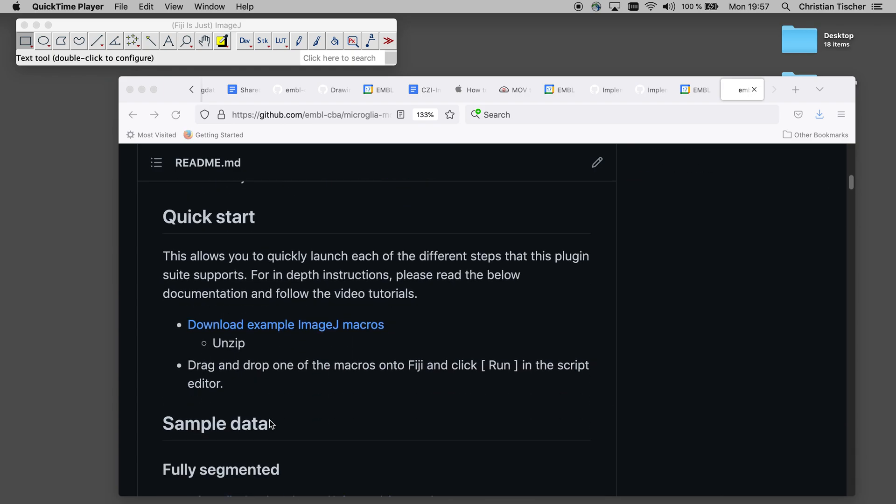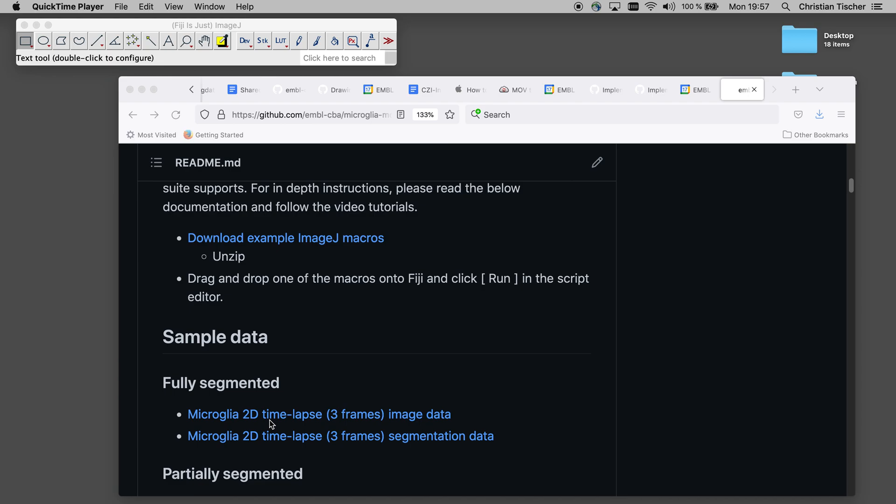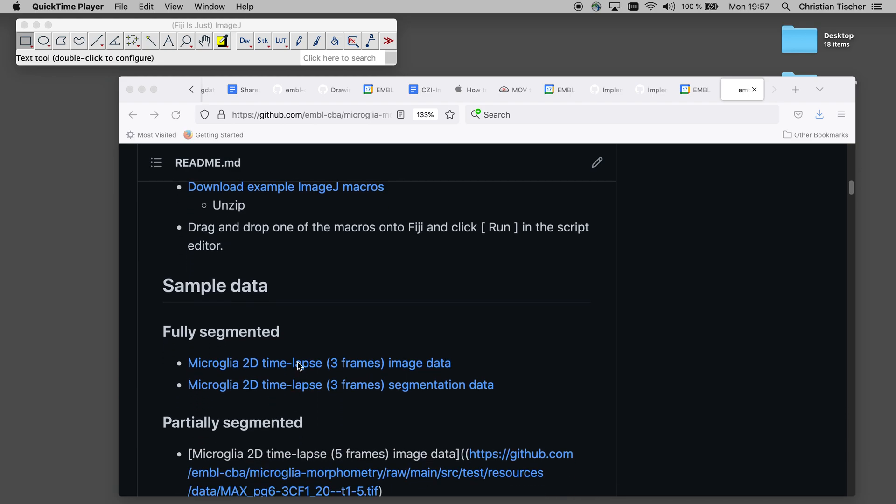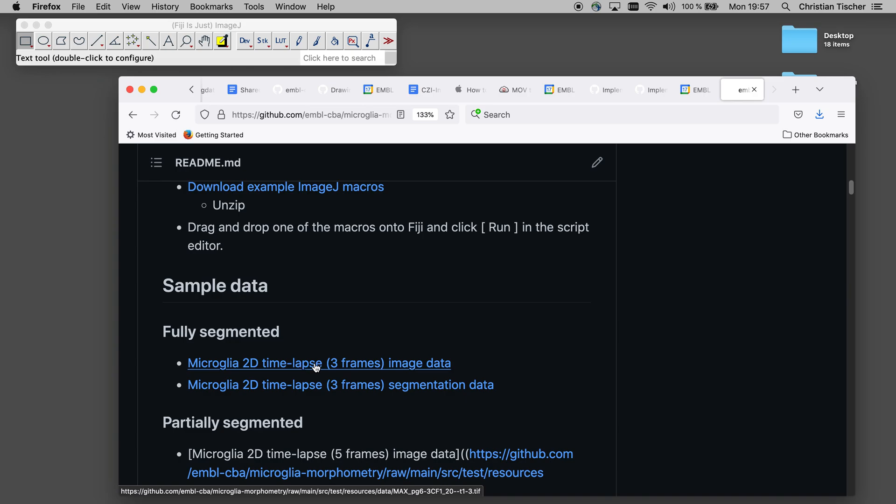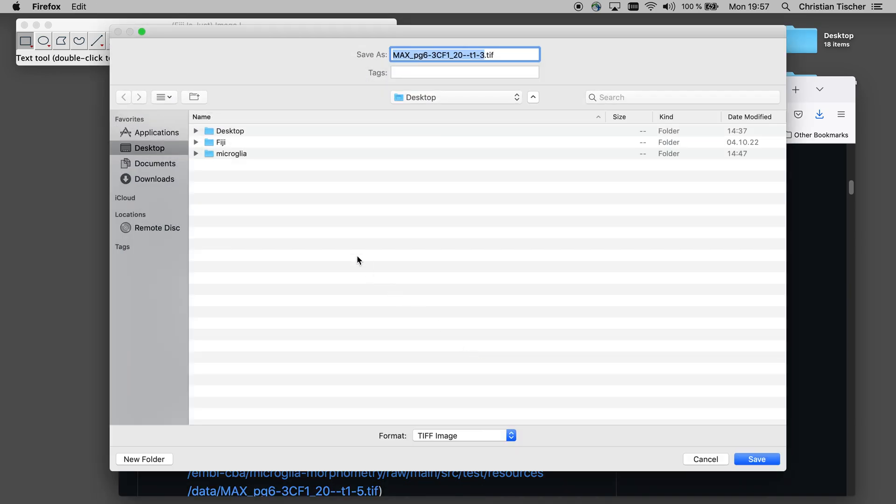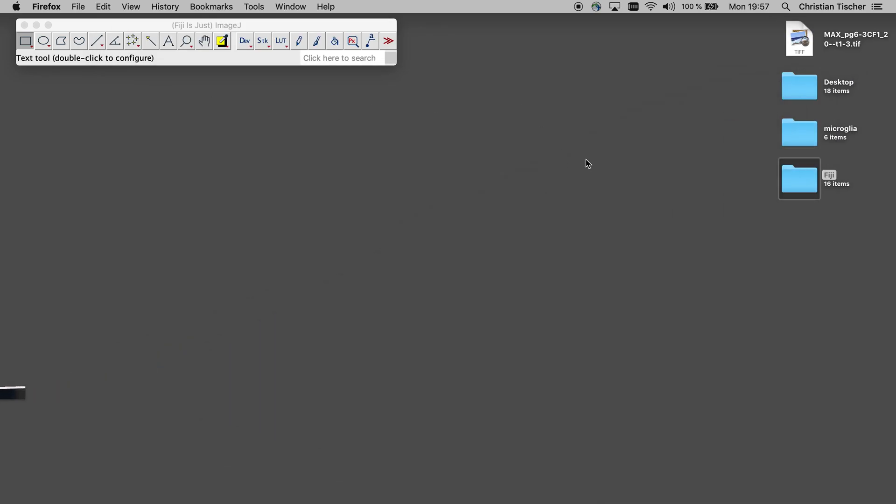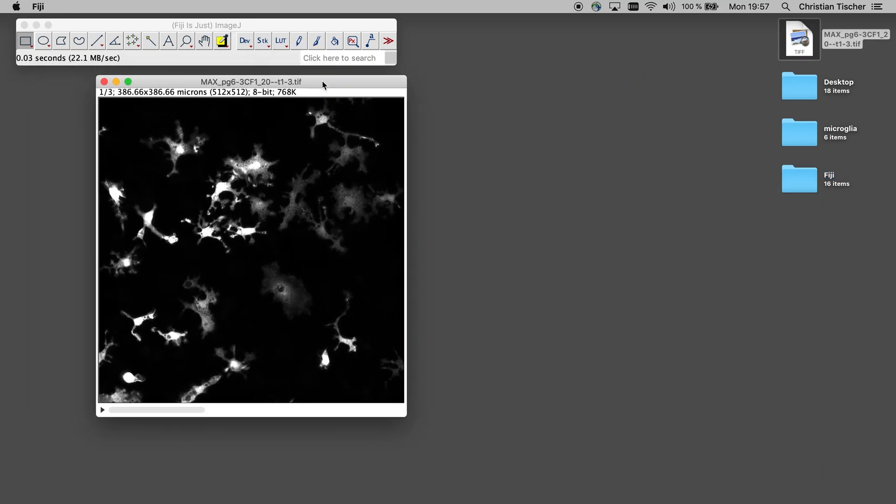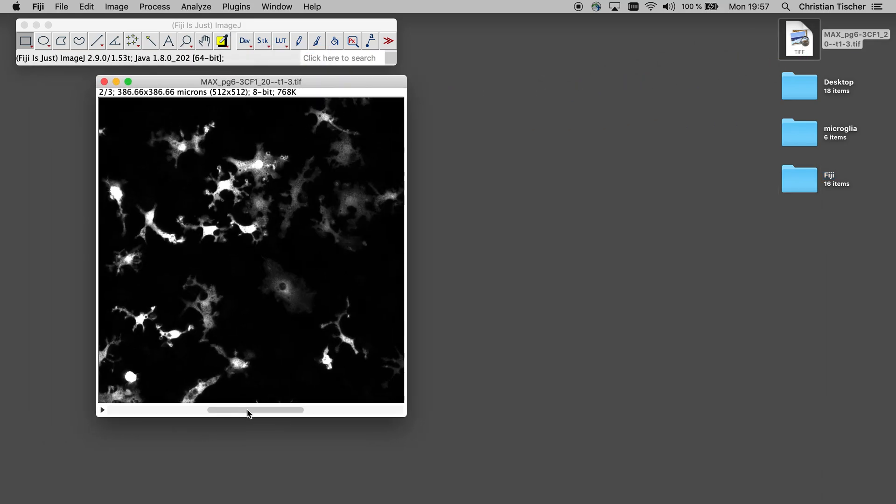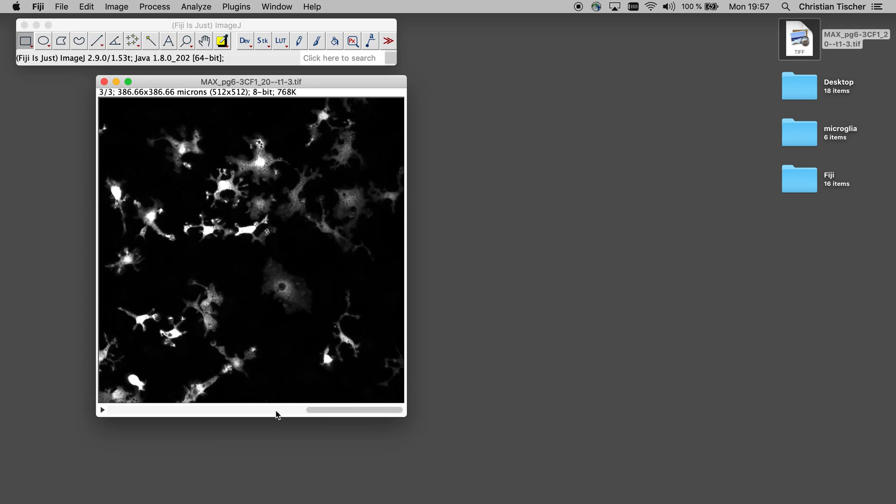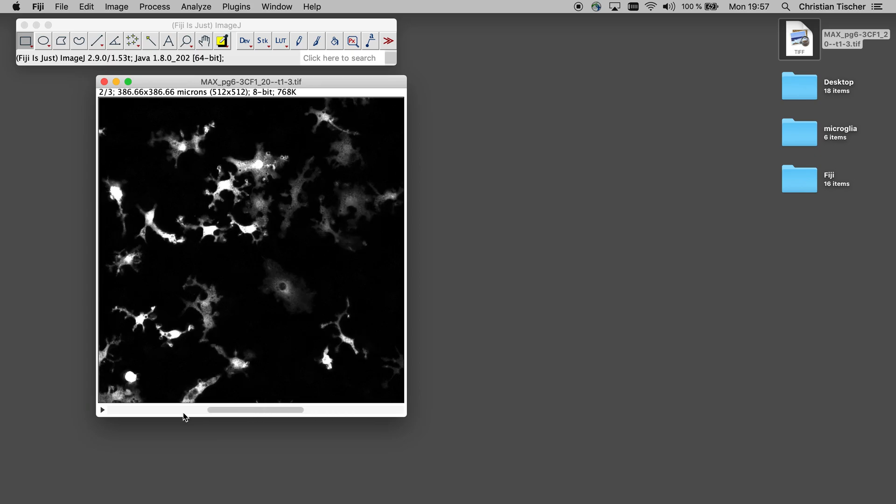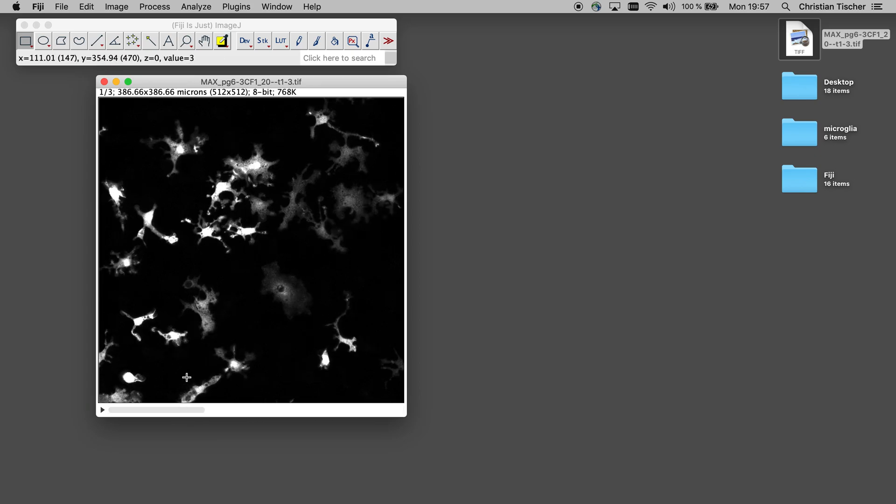And I will now download this example movie. I'm just saving it on my desktop. You can have a look. So this is a movie with microglia cells, just three frames that are moving.